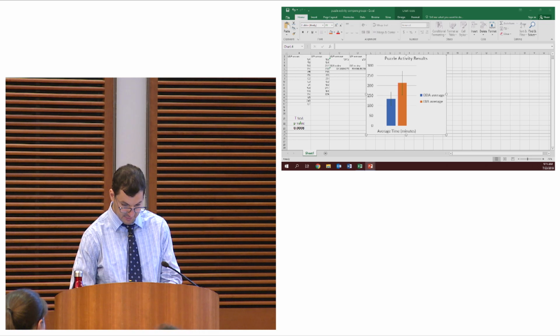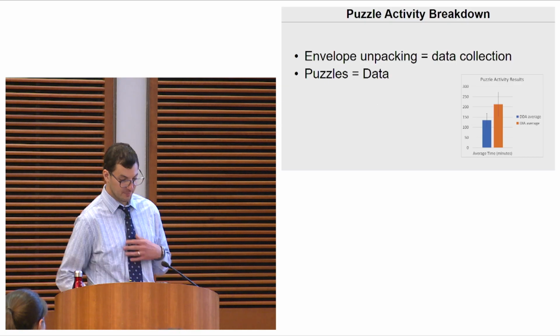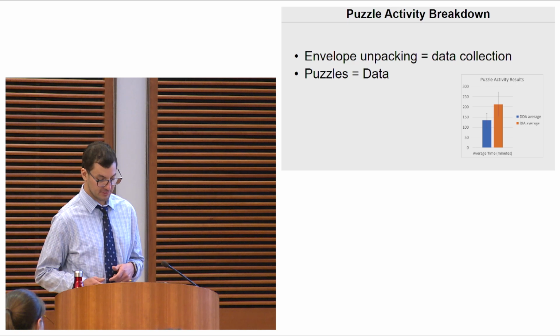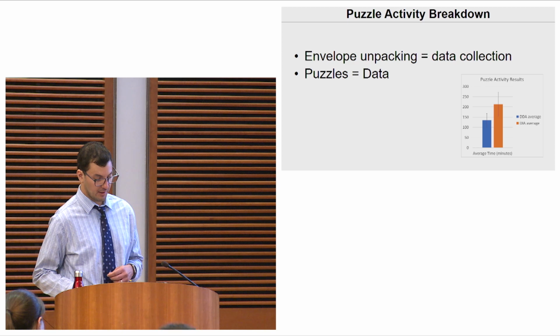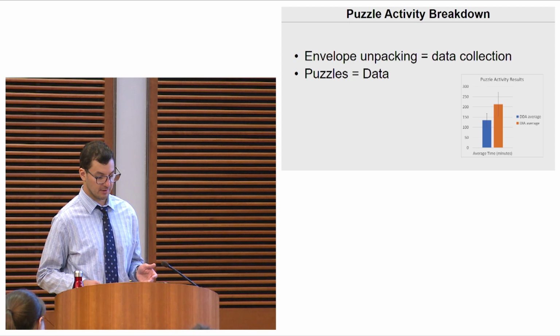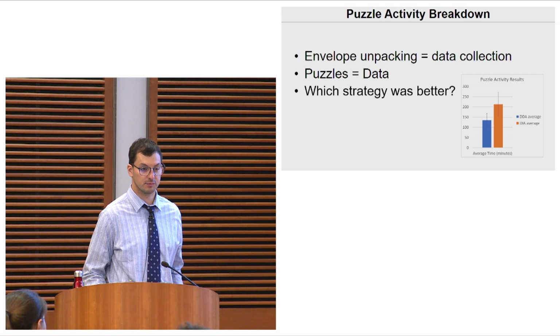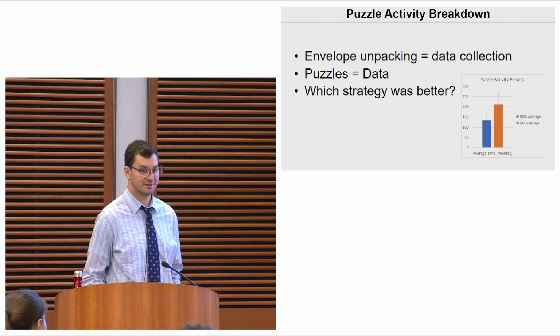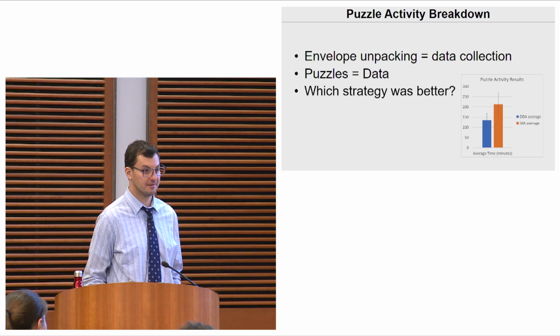Let's talk about what just happened. So the envelope unpacking was meant to represent your data collection, and the puzzles were meant to represent your data. And I was hoping that this would help us understand the strengths and weaknesses between DDA and DIA. So let me just ask you guys, what do you think about which strategy was better? Depends on what you want to do. Does anyone have any strong feelings that one was better than the other? No? Okay.